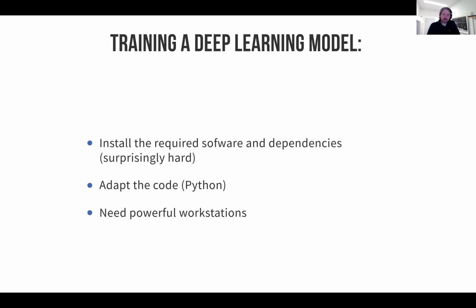I was trained as a cell biologist, and it was surprisingly hard to get started with installing all the required software and dependencies, and how to connect my graphic card to the right environment with the right things and so on. And then you often need to code, because generally tools that are released come as packages when they are well developed, so you need to be able to manipulate that.